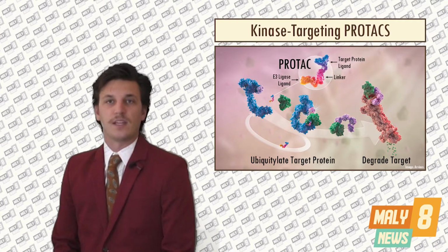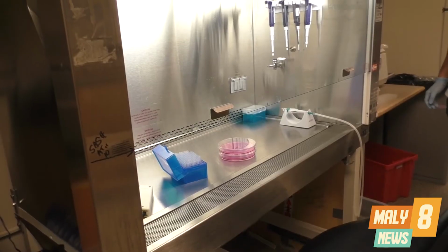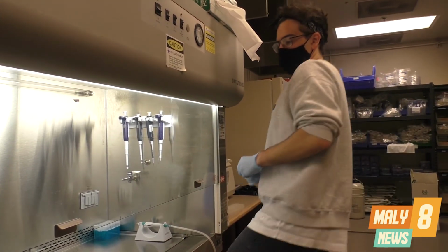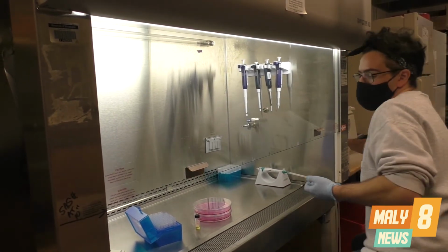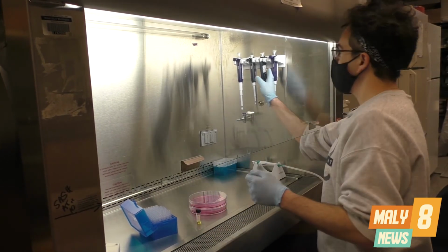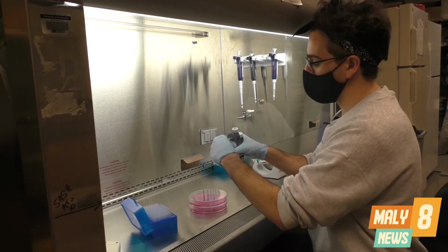Next, we'll check in with Dan, a first-year graduate student with a passion for proteolysis targeting chimeras, or PROTACs for short. For more on that, here's Dan. Hey, what's up, Dan? Oh, hey Zach, how are ya? Doing well, how are you? I'm doing well. So, I hear you make these small, teeny tiny little molecules, and then what do you do with them? Yeah, so I have them in a DMSO solution, and I'm gonna go ahead and treat the cells that are in media, and then I can measure protein concentrations afterward, and we can see if they actually do any degradation.